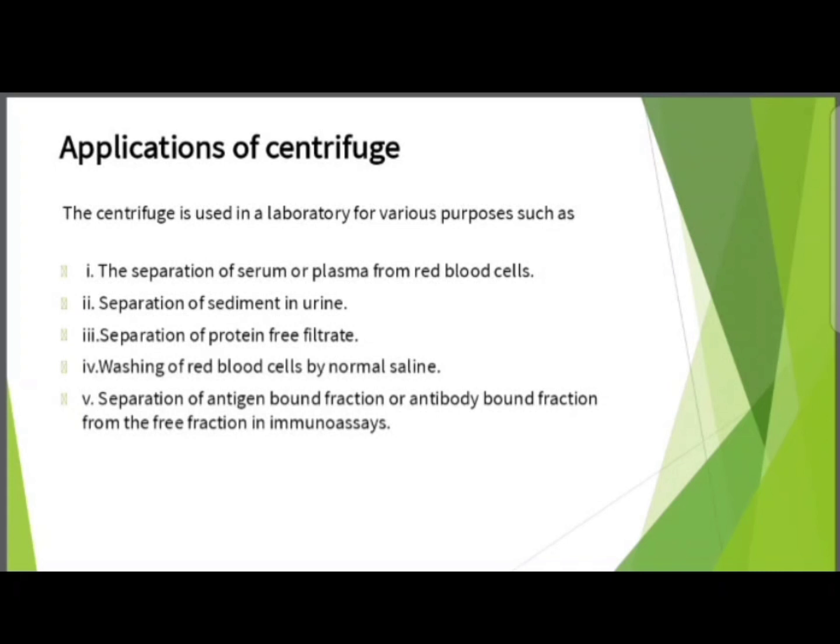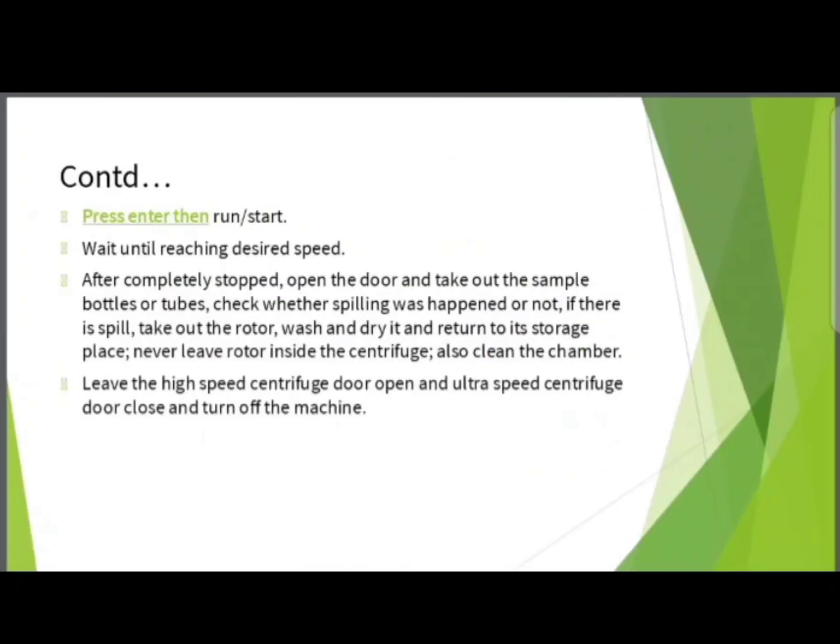What are the applications? It is used for the separation of serum or plasma from red blood cells, separation of sediment in the urine, separation of protein free filtrate, washing of red blood cells with normal saline, and separation of the antigen bound fraction or antibody bound fraction from the free fraction in immunoassays. Basically, its uses are in the laboratories.